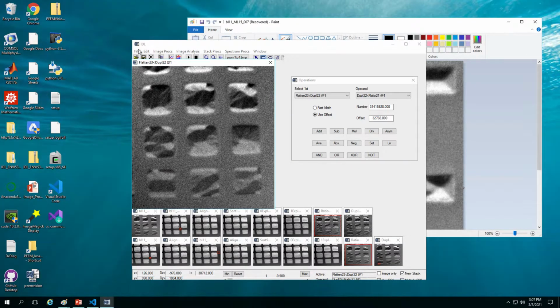I would encourage you not to always use parabolic flatten. Let's keep it the way it is. But if you do think there's a large contrast in brightness compared to the substrate, then you might do it. Although here I still don't think it's the best scenario for this example. You see, probably the beam is more focused here, and here it's brighter, but here it's too dark. Usually this part should also be white. But this is something we'll address later in other processing.